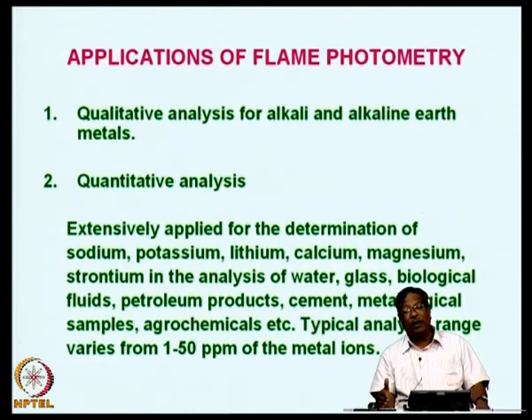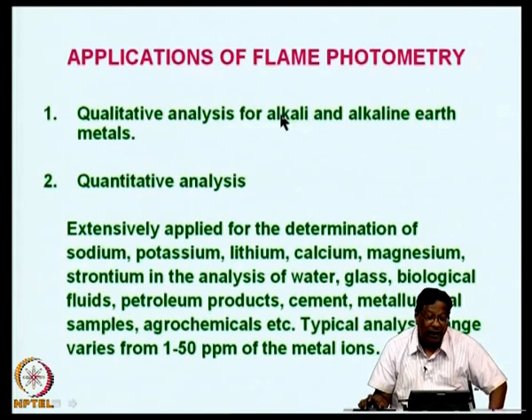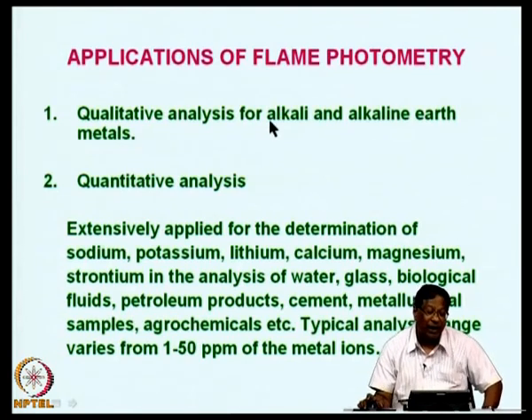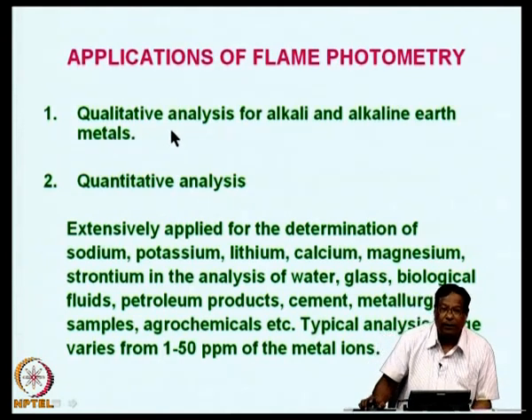That does not happen with a plain flame. If there is a flame containing sodium, you cannot correlate it to concentration, but in a flame photometer the concentration relations can be established. So, a pass fail test you can always do in flame photometry, to check whether the sample contains sodium or not.